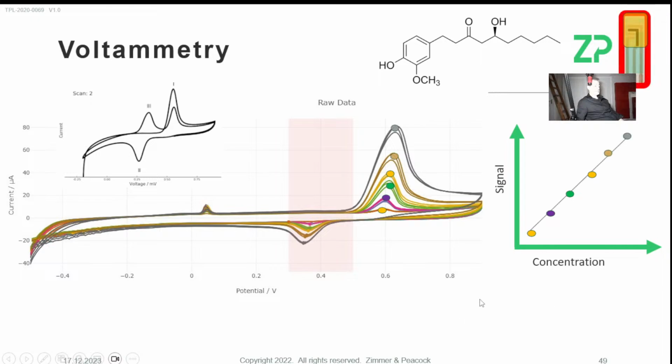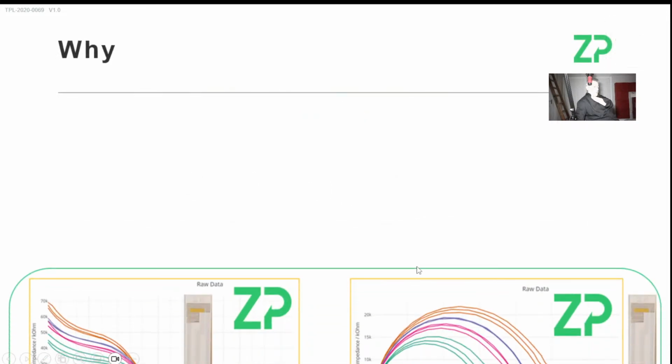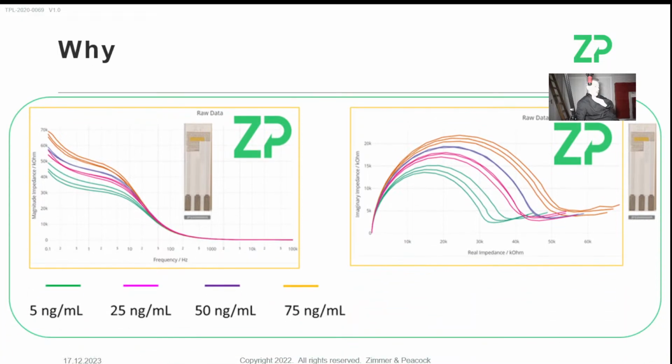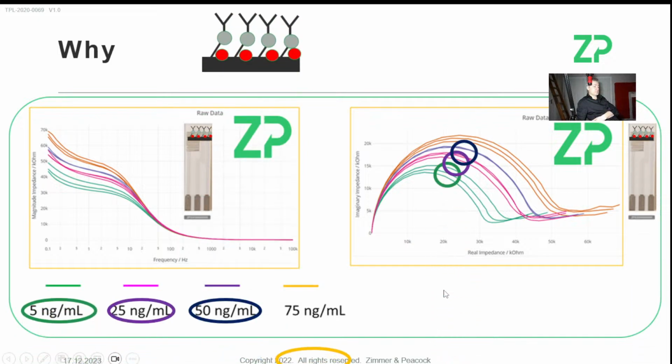That said, I just want to comment on gold and platinum. This is also in reference to question number 5, who's also asking for, I think, a platinum electrode as well. I do focus here on gold, just out of interest. Our gold electrodes are really good. We do use them a lot in aptamer work. So if somebody's come to us with a hormone, we might end up using an aptamer or an antibody, and we often use the technique of EIS. I do cover this quite a bit in some of our workshops as well. But we do use gold electrodes quite a bit in these kinds of immunosensor type assays.